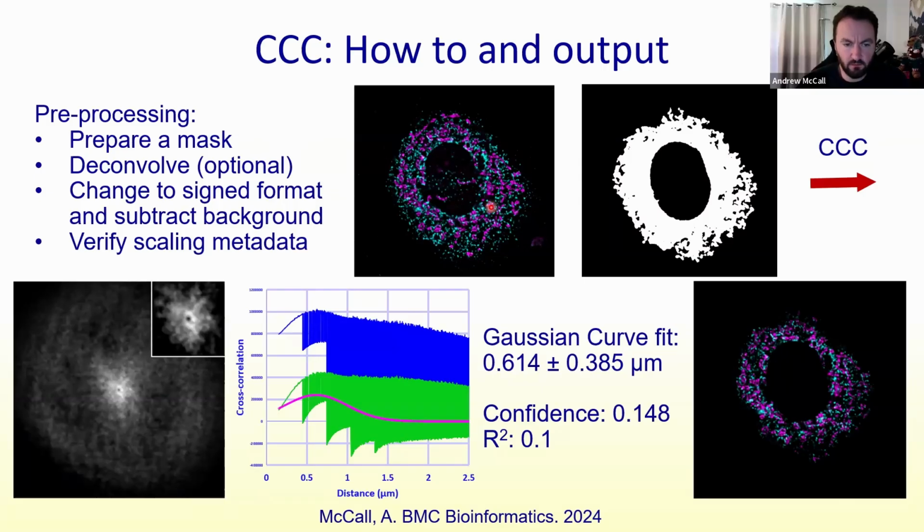So if we are looking at the cross-correlation between the endoplasmic reticulum and mitochondria, like in this image, we're basically looking within the cytoplasm. So the mask that we're going to use needs to be a mask of the cytoplasm. That's generally how it works. You are not creating a mask of your data. You're trying to create a mask of where your data lies, what it's contained within. That's the general idea. Beyond that, you're not going to need any more masks.